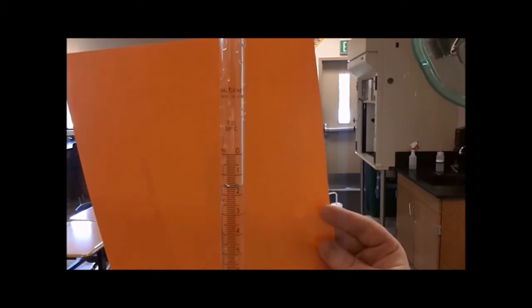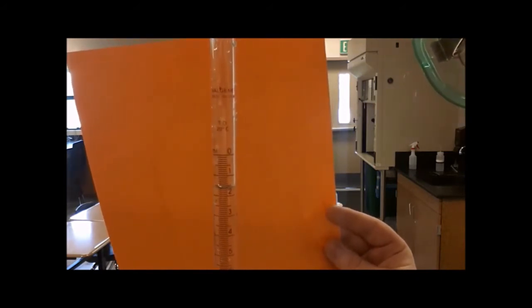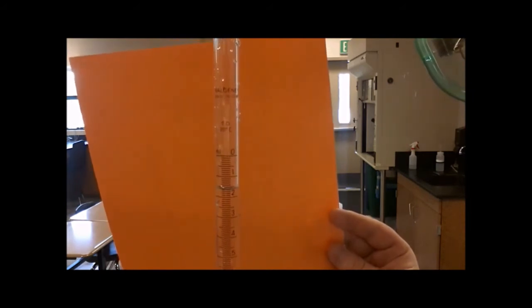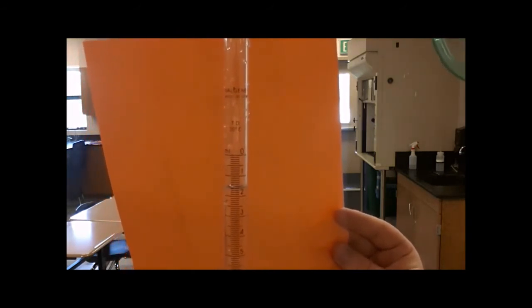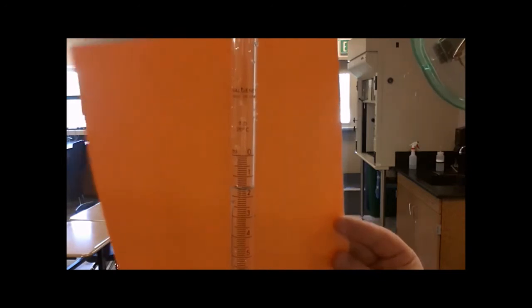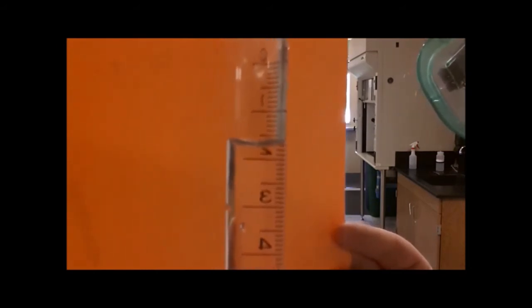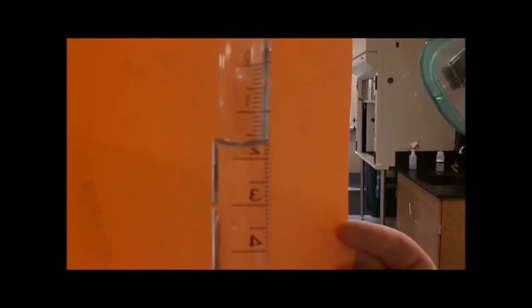Notice the starting volume. The starting volume is actually about 1.65. The starting volume is not 58.4. When you read the volume off the burette, you read the volume directly as it says. So this volume is about 1.65. You're going to estimate that last digit, and sometimes it helps to put a piece of paper behind it so you can see it. See the numbers? The numbers count up from zero. And again, you want to make sure that you read from the bottom of the meniscus. See how good of a measurement you can get from this. You can estimate between the lines, and that will give you out to the hundredths place.